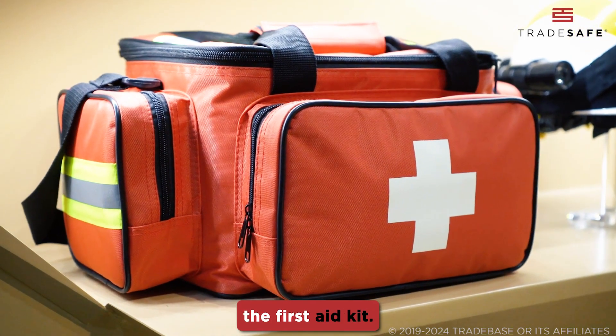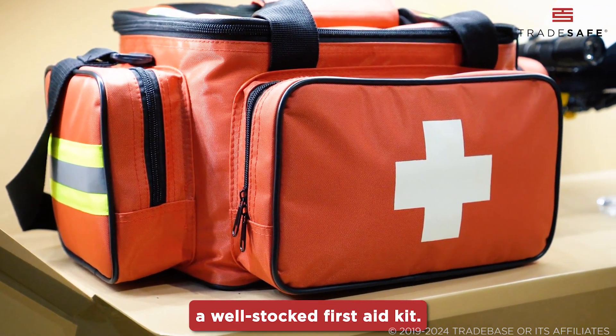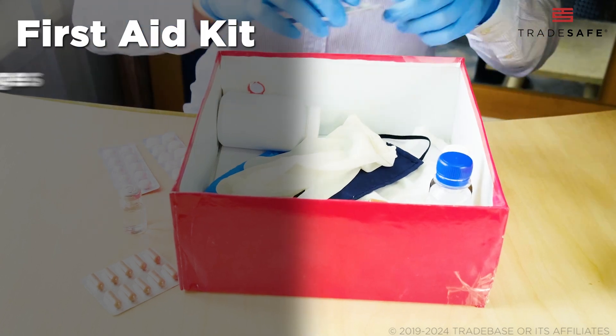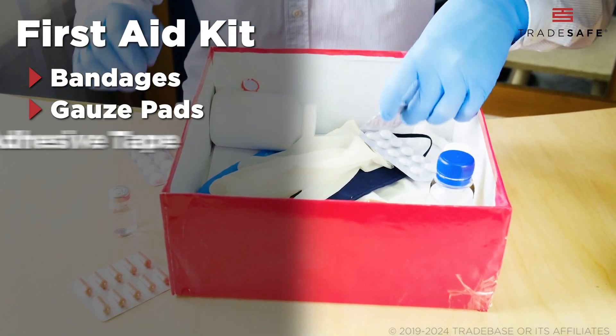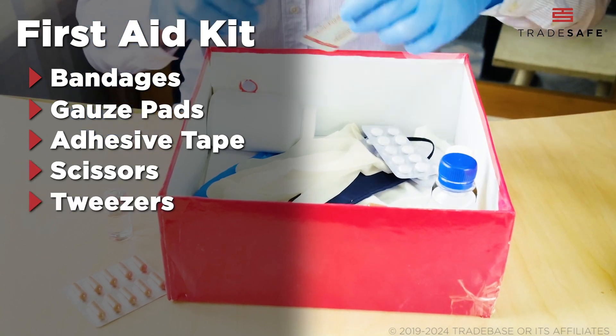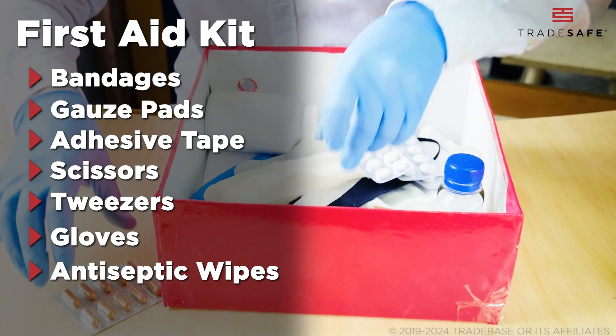Finally, let's talk about the first aid kit. No lab is safe without a well-stocked first aid kit. This usually includes bandages for cuts and abrasions, gauze pads for larger wounds, adhesive tape, scissors, tweezers, gloves to maintain hygiene, antiseptic wipes to clean wounds, and burn cream.